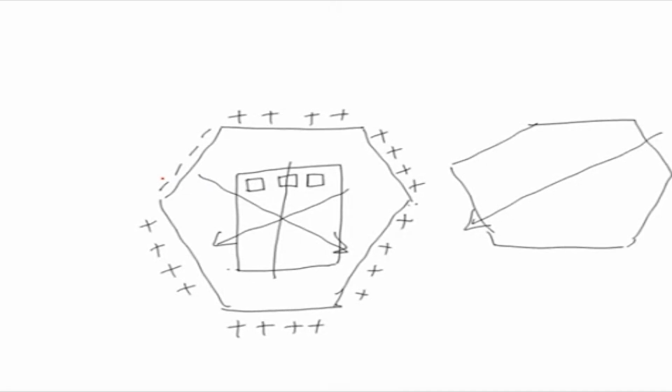There could be other patterns. In field inversion gel electrophoresis, the pattern of these 4 electrodes will be different. You have the gel loaded in here, and you apply the electric field in 2 directions. One direction is in this direction, another direction is in this direction, that is at 180 degrees.